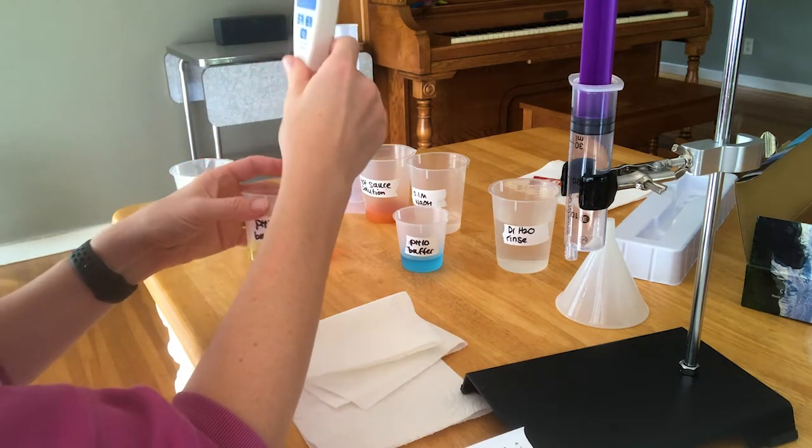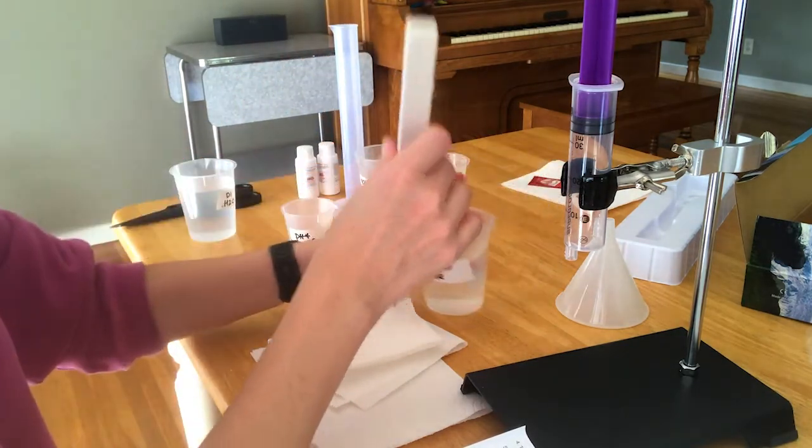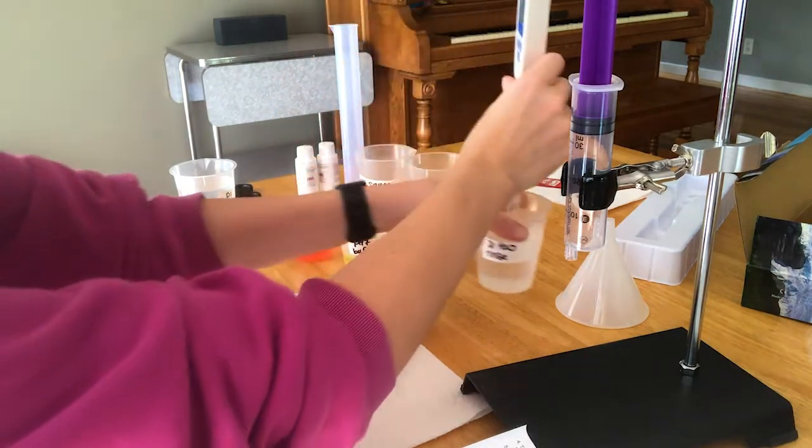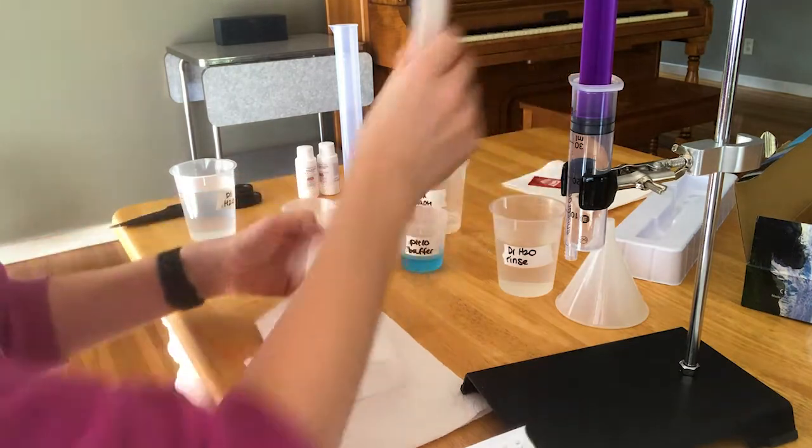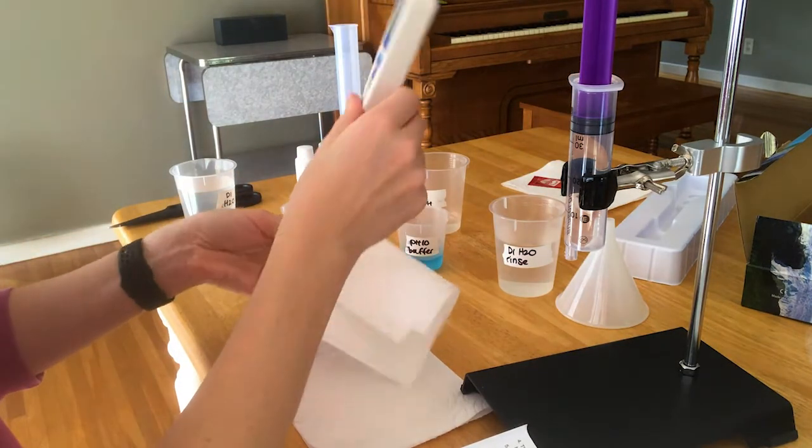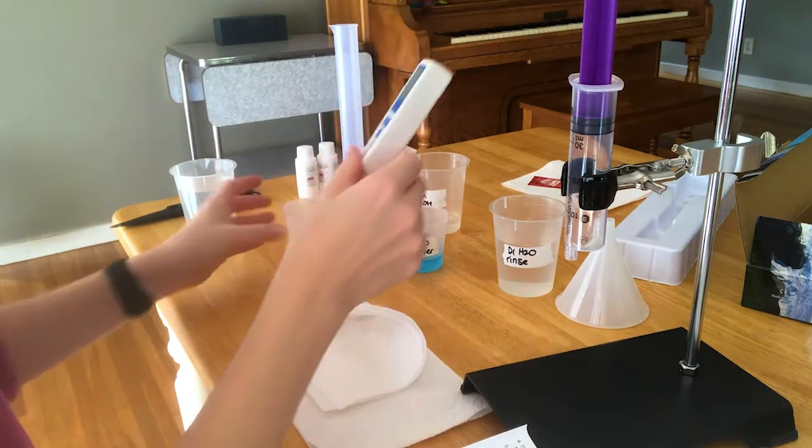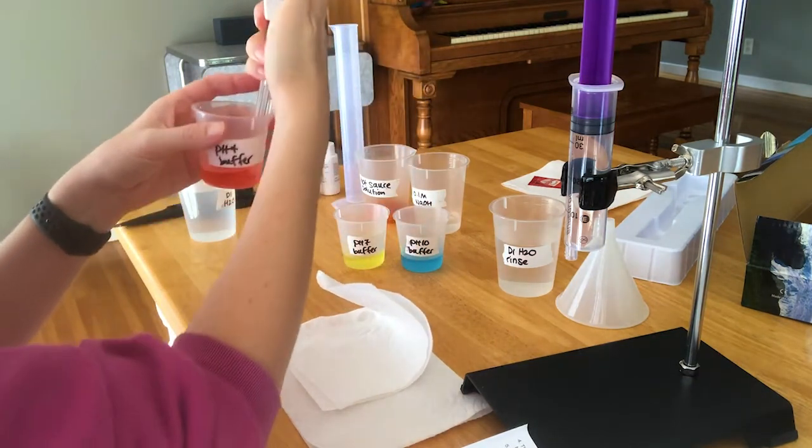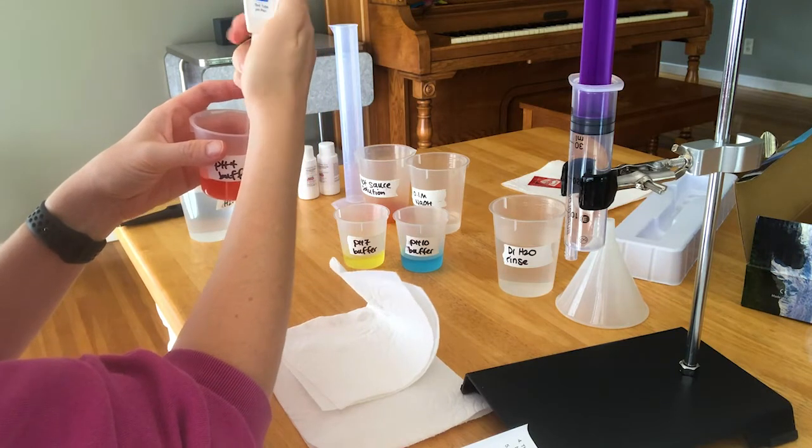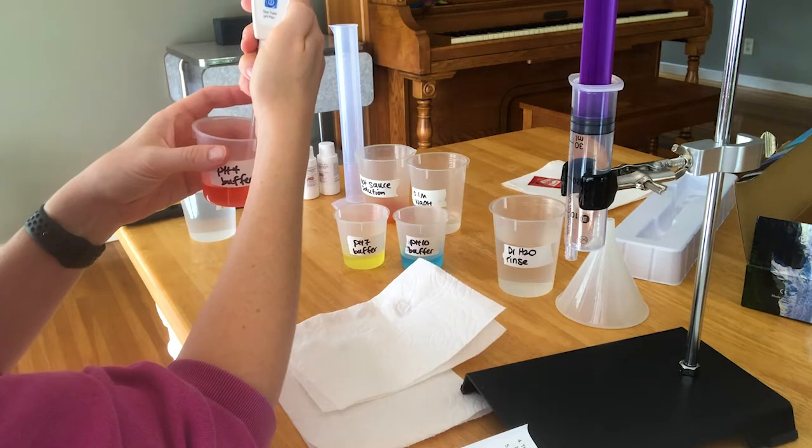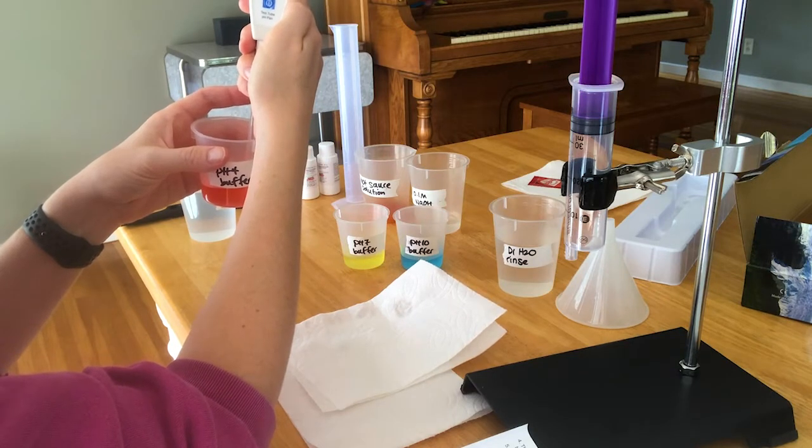In between solutions, I want to make sure that I rinse it off, dab it gently, wipe off the outside. Then we're going to use the pH 4 buffer. So once again, press calibrate. I know it's cut off, but what it says is 4. Then it's going to say SA. When it's done, it'll say end.